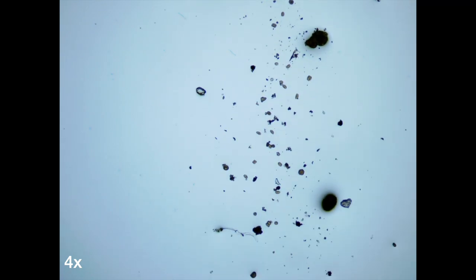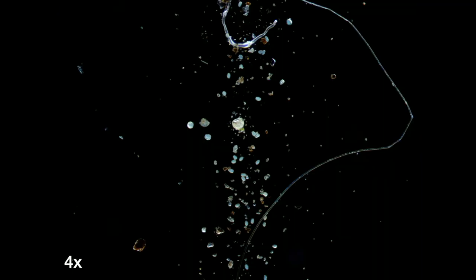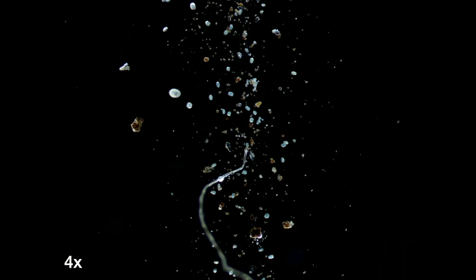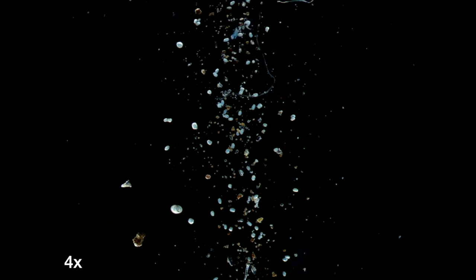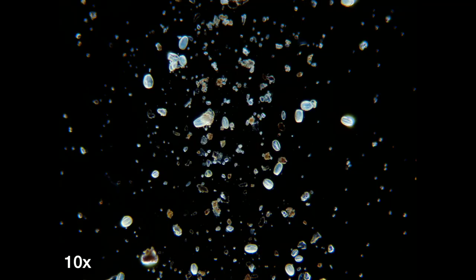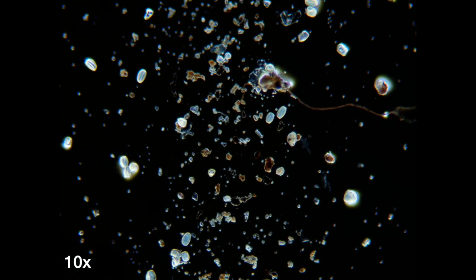Some of them are debris, inorganic debris or organic debris, microplastics, something that looks like minerals, but you got practically most of the things that were in the air while you were biking around. Enjoy!